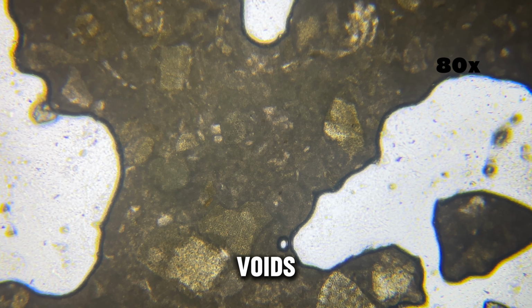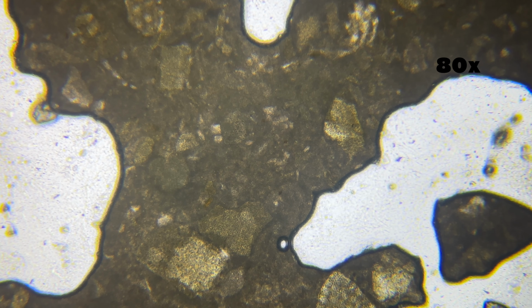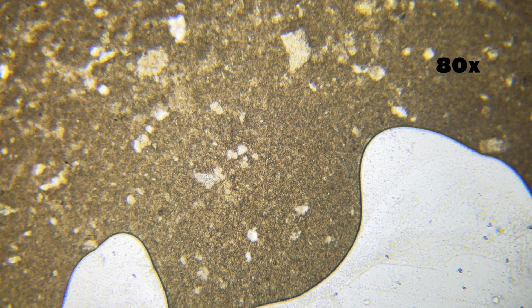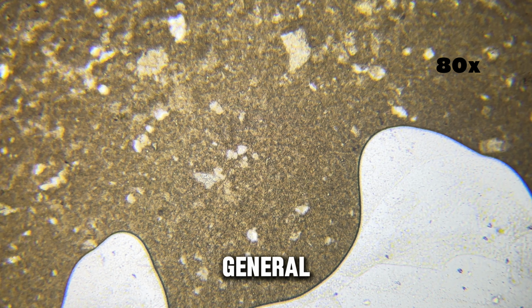Small rounded voids are scattered across the background. They vary in size and appear randomly placed. The structure already feels layered rather than smooth. At this level, mustard no longer looks like a simple sauce. It begins to resemble a thick mixture built from many blended elements. This first magnification gives a general impression of mustard as dense but unstable.